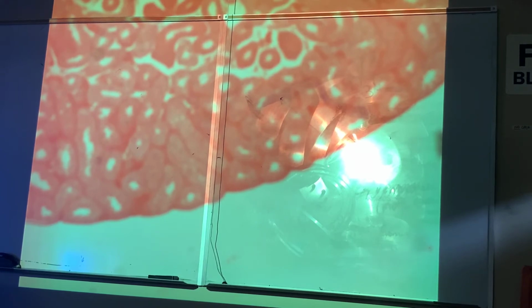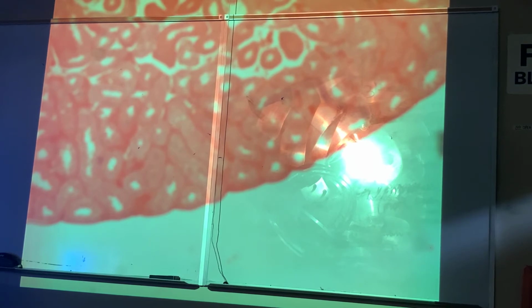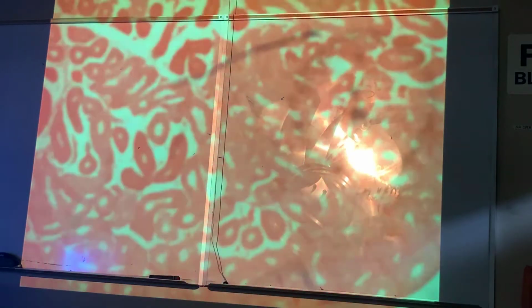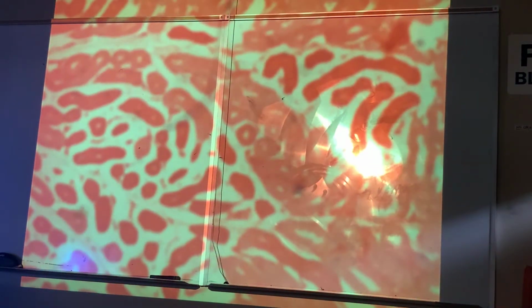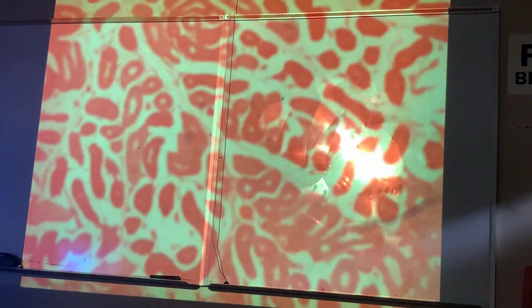Now, you're not gonna have to tell me what kind of cell you're looking at. You don't need to tell me if it's undergoing mitosis or meiosis, but you should be able to tell that it's not a pretty layer of epithelial cells and that they're cells undergoing cell division. I'll show you how to tell that. You're not gonna see any microvilli on the apical surface like you would in the epididymis.